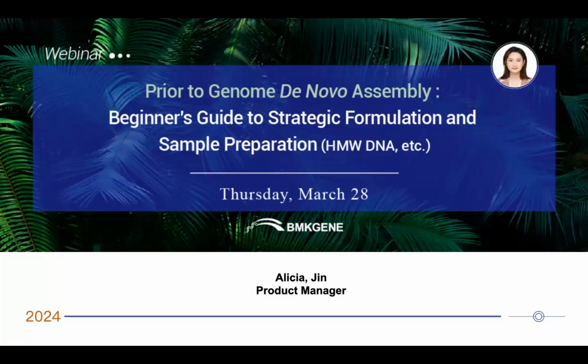Since de novo genome assembly is a very complex project, if you want to start the assembly projects, then before the project you need some information for the preparation. So here I will share some information about the strategy formulation and also the sample preparations to help you. I hope it can help you to find some ideas to prepare for the project.